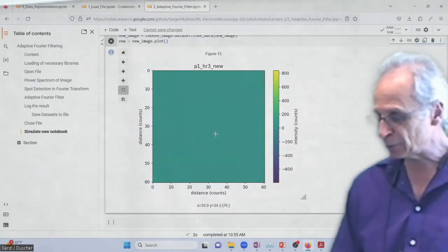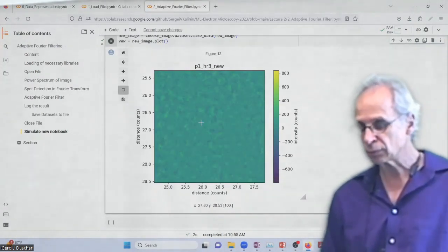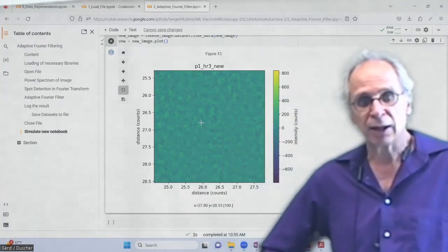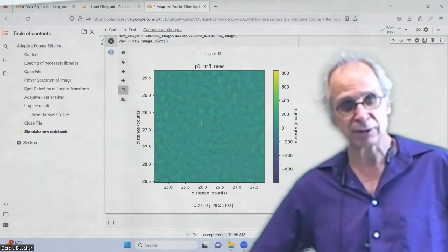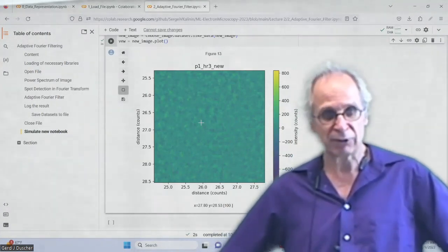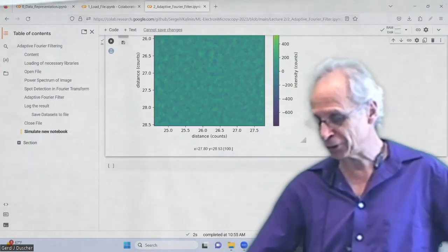I'm trying to get to about where I was before. And what I did throw away is mostly high frequency noise, right? Low frequencies are still there. This is a test that is really, really necessary for any kind of image analysis. Just subtract it so that you know what you took out, that might be relevant and it doesn't get you in trouble, or might be the most interesting thing in your image or in your data.